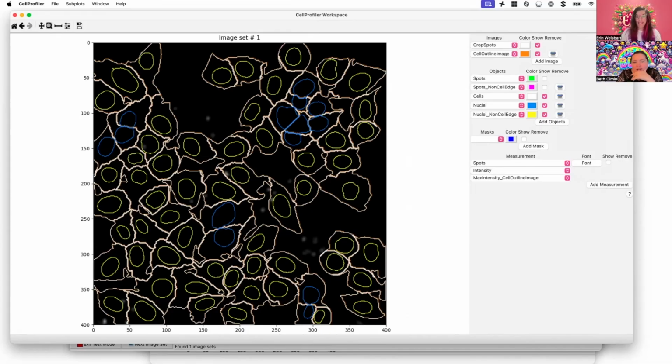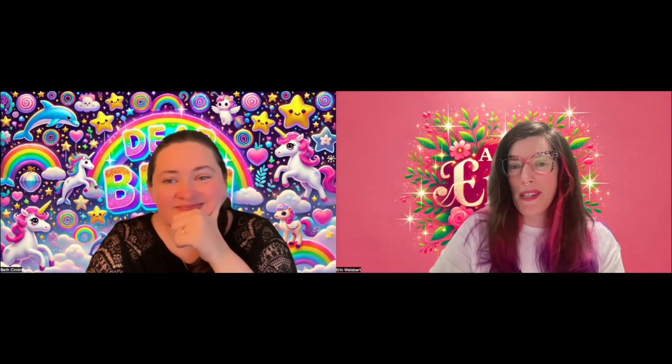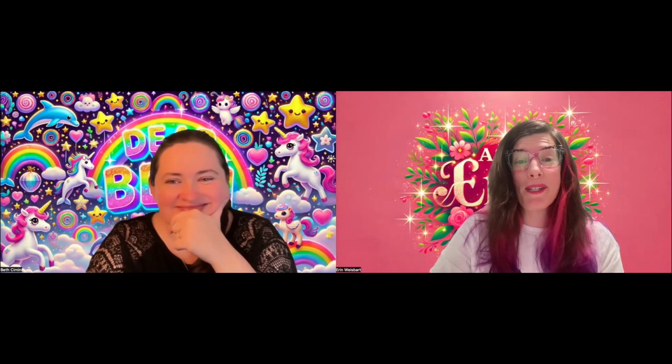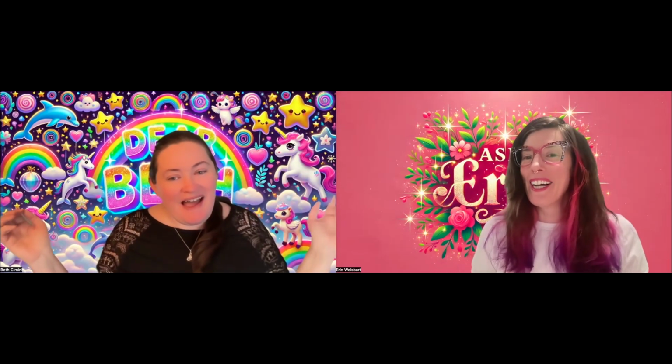Now, are there ways we could do it like how far is it from the edge? There are ways we can do how far, and I will be showing that in an upcoming episode of Ask Erin, Dear Beth.